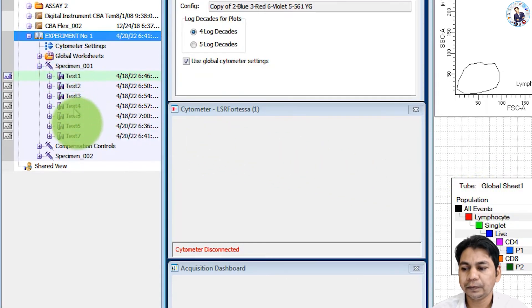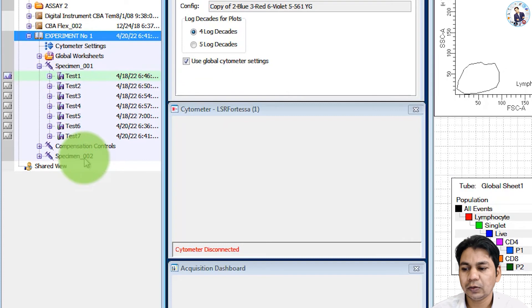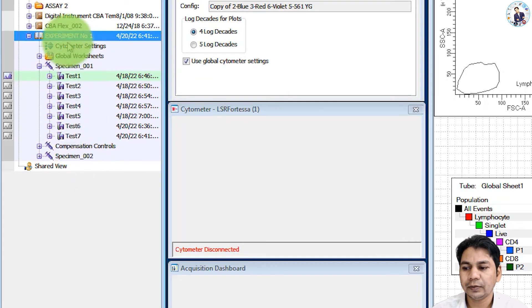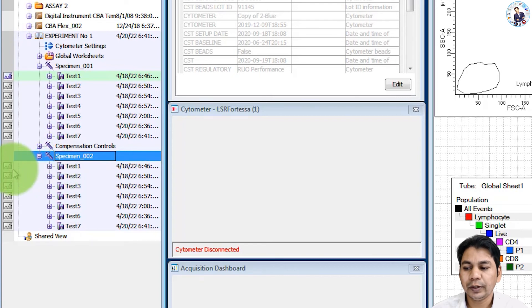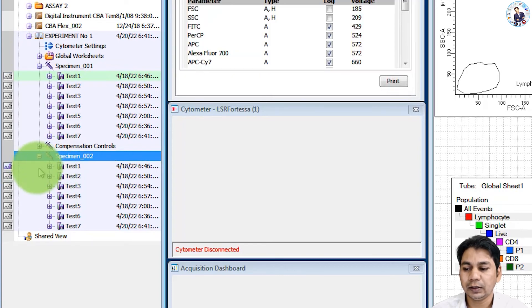You can see specimens 002 is added in this experiment. Open this. You can see the imported FCS file is present here.